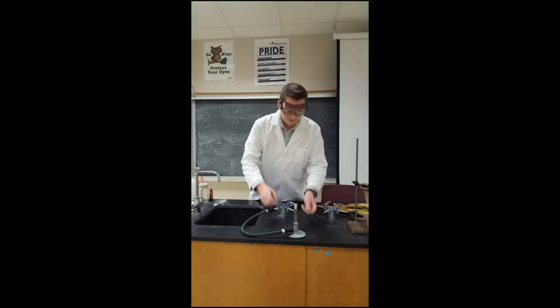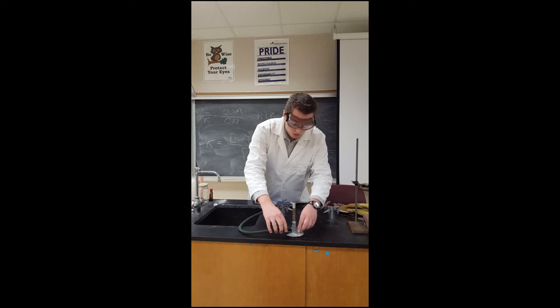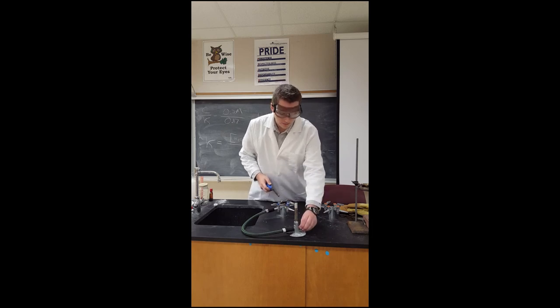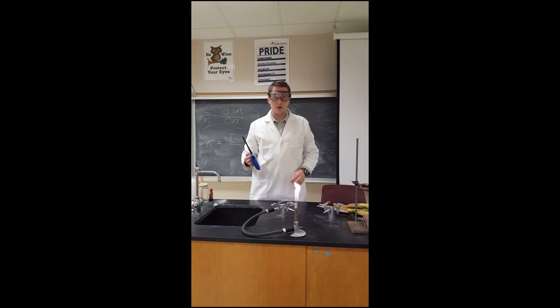We're going to take the barrel and put it back in. Now, if we close the collar all the way and turn the gas on, the gas comes through the tubing but stops here because the collar is closed. So that's no good. Now we open it — not all the way, but enough — and now we have a situation where there's a nice little flame.